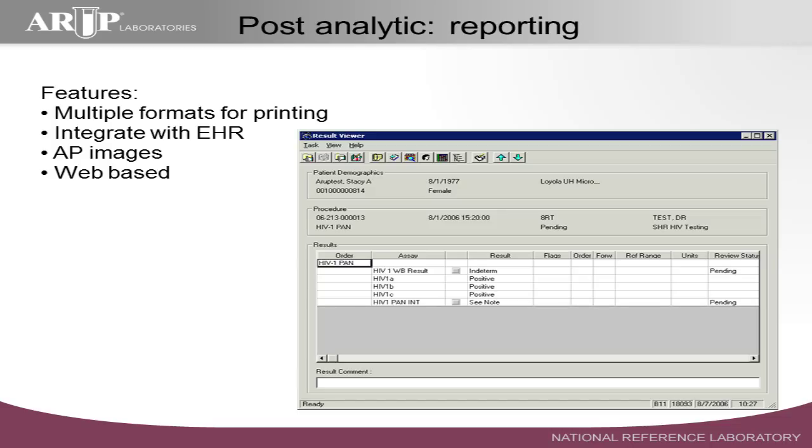But what I'm thinking about is if you just make it available and you wait for the clinician to come up to their system and display it, they have to wait for that. There are some instances, perhaps like with stats or where the results are really abnormal, that you want to push those directly and get the clinician's attention right away. So does anybody know how that's handled at ARUP? They come directly. They call, yeah. So we don't rely on the information systems to do that. They pick up the phone and they make a call.